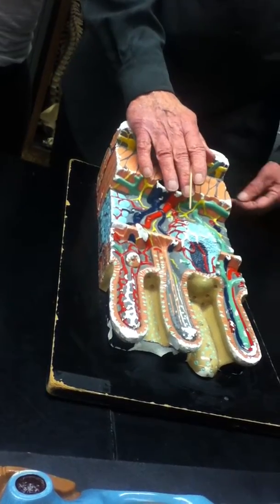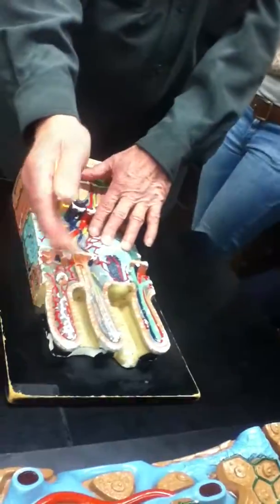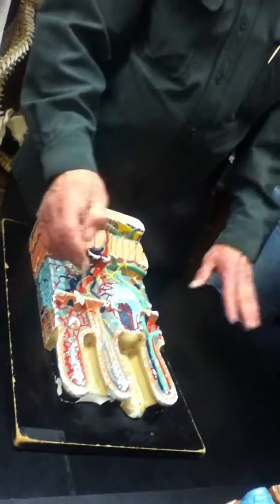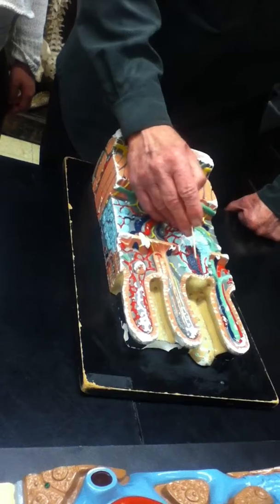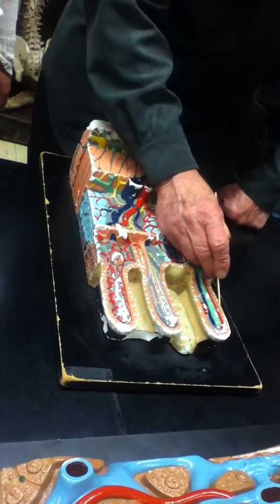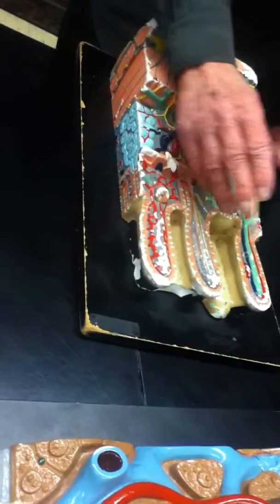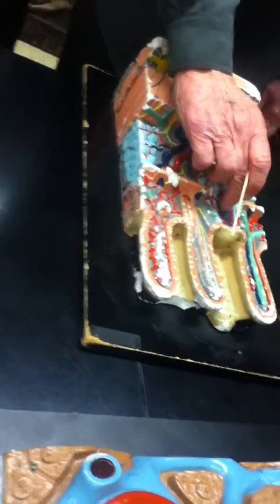So, of course, it's not surprising that an area that's going to be richly supplied with bacteria, which could injure us, is going to have a lot of protective elements present. So besides the Paneth cells, we've got these lymphocytes. And the lymphocytes move away from here, they wander. So here you see a little purple cell, here's a little purple cell. These little purple cells, which you see here and there, are wandering lymphocytes, which are wandering away from here.